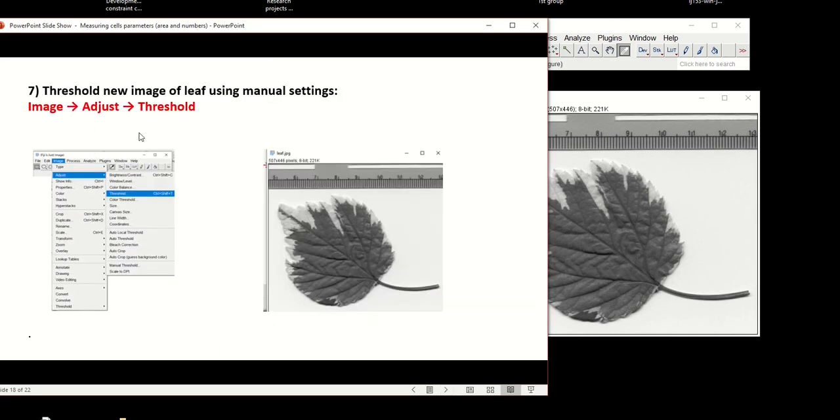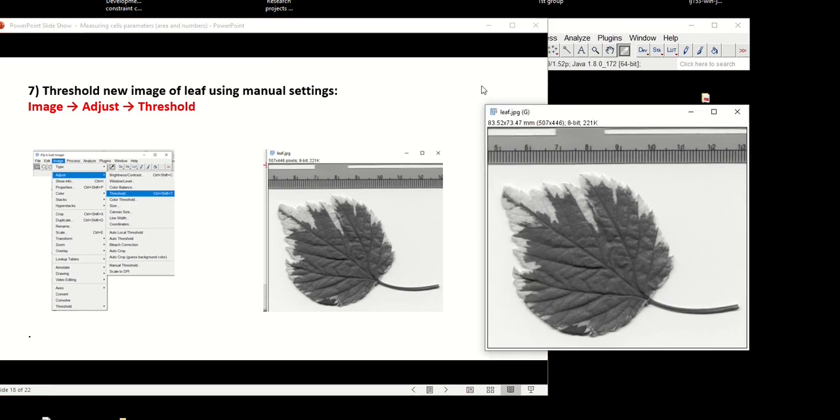And now we have to do something a little bit different, that we are going to have a threshold. In the previous one, we just automatically removed these sections, and maybe sometimes the software could have made a mistake, and now we're doing this in this way. We're going to do it more gradually.